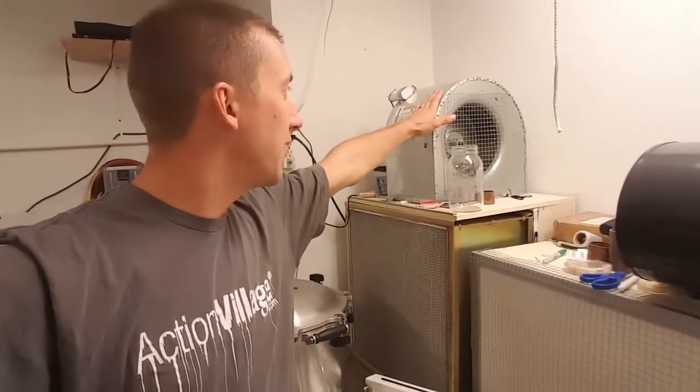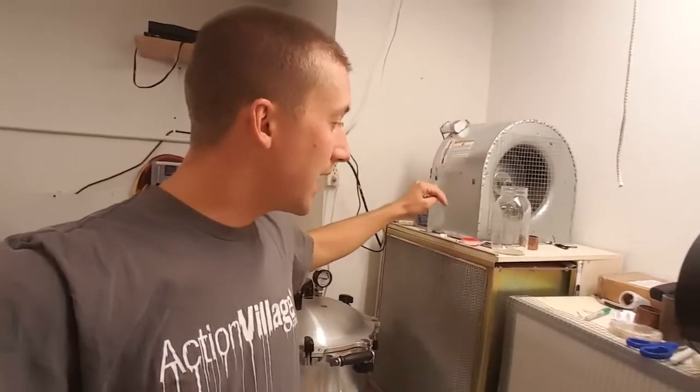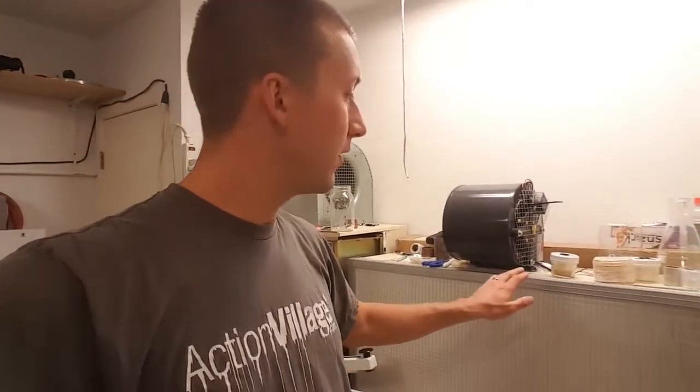This one I just bought a used blower fan for a furnace — it's a little bit big, it actually pushes about 300 feet per minute. The target is around 100, but I'd rather work in front of a flow hood with around 200 to 300 feet per minute because it cools you off better as you're working. If you're packing out 50 to 100 bags you work up a sweat, and working in front of a slower hood like this one which flows around 130 feet per minute is not as cooling.